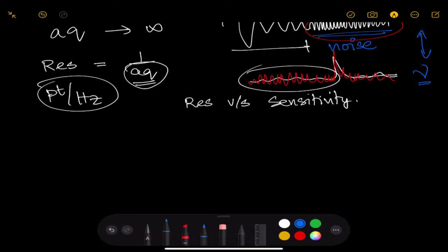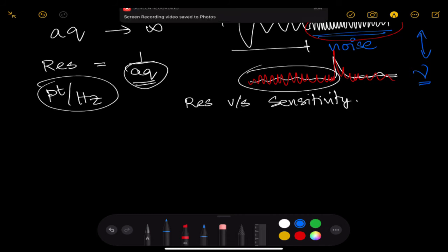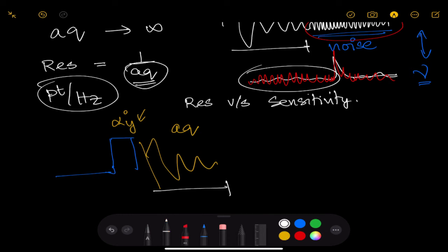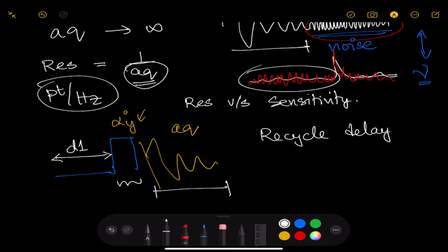Having gone through these many points, there are only a few subtle features left to be understood in the pulse program. So let's go back to our excitation pulse followed by the acquisition of the free induction decay. We said it's going to be given by a certain flip angle at a given phase, and you end up acquiring the signal. We have discussed most of the data acquisition, and the perturbation has been covered in great detail in the classical portion and also in the quantum mechanical portion. Yet another aspect to learn from here is this important delay called the recycle delay. In a few places, this is also referred to as the relaxation delay.